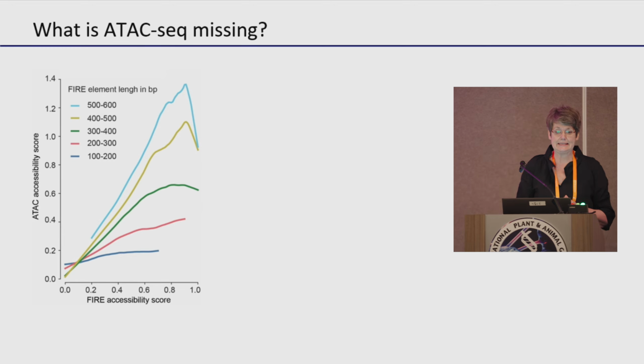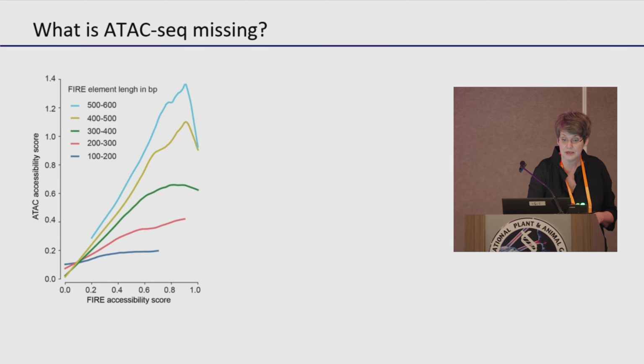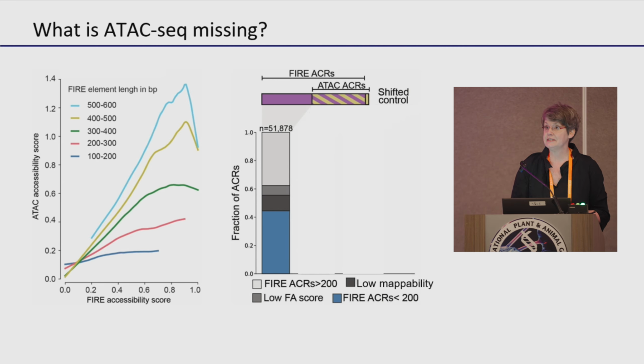On the y-axis, the ATAC accessibility score. And what I hope you can appreciate is that for elements that are rather short, below 300, below 200, actually, which is the threshold we decided upon, these elements are not detected by ATAC-seq whatsoever.